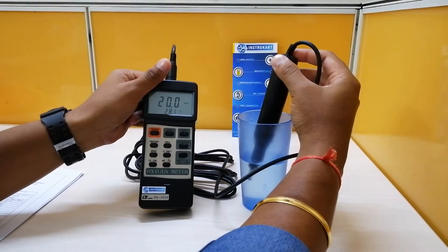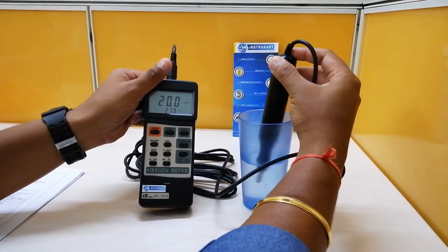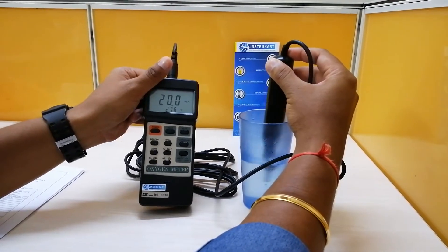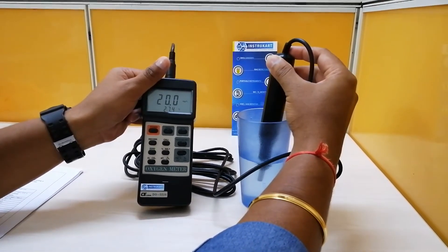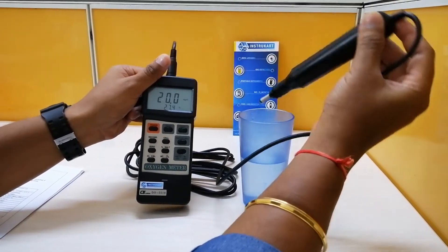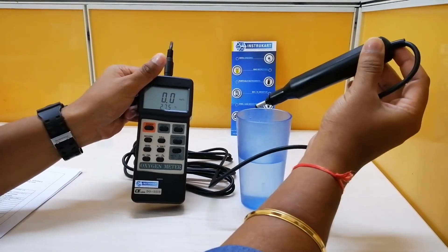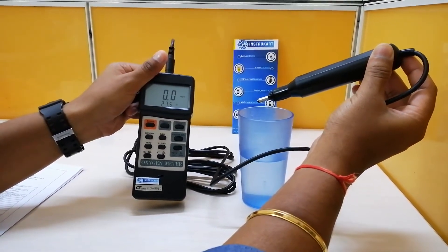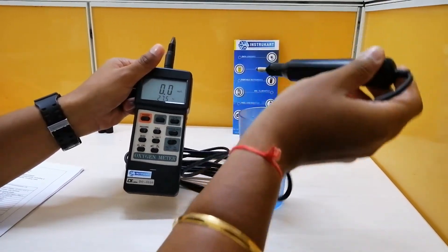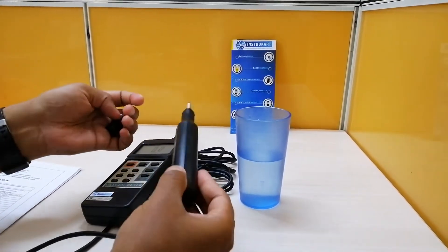You can see the meter is showing the value in mg per liter, and the temperature is also displayed. That covers the DO demonstration. Now I'll demonstrate the oxygen in air measurement.